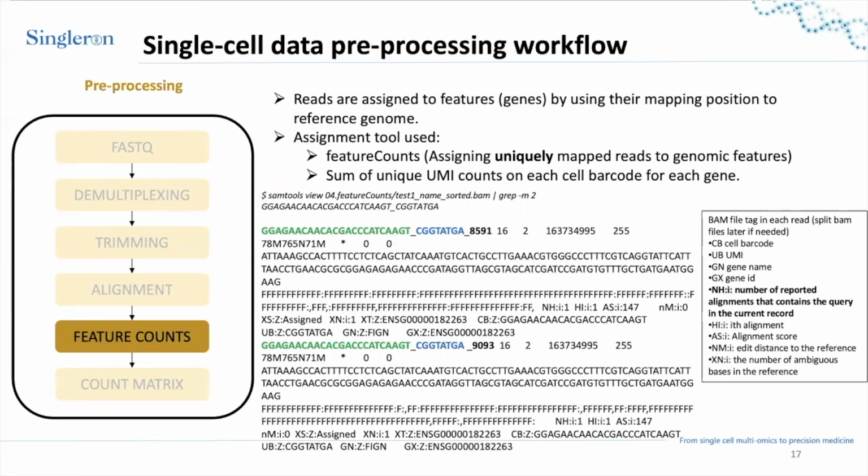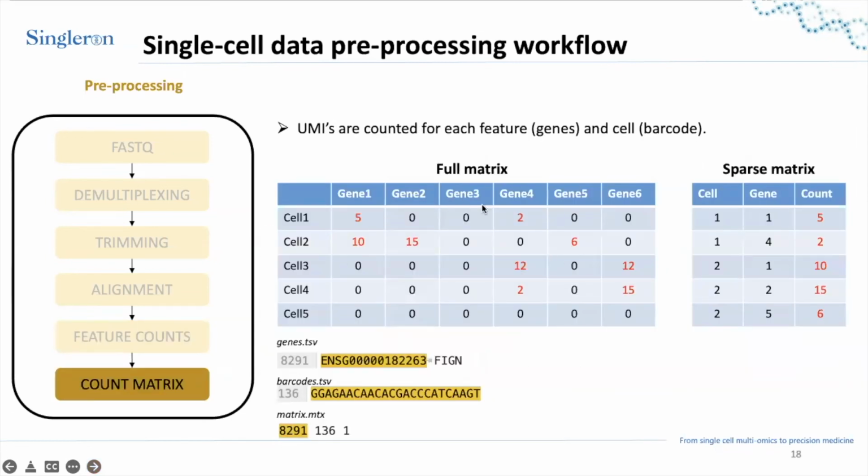Yes. And so, sorry, go ahead. I think this may be one of the time-consuming parts for single cell. I suspect for bulk-seq, without this step, it may be slightly faster. But you lose the ability to assign the UMIs to each cell at the cell level. Many of the downstream analyses depend on having these different cells and the ability to group them into different subgroups to conduct further analysis and then derive some insights into your sample and the data.